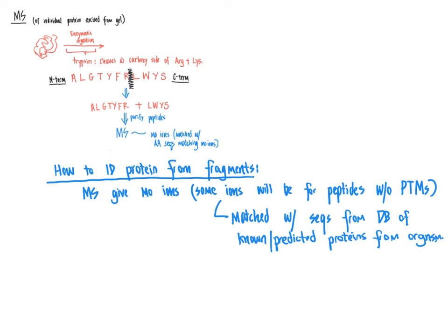And that will allow the identification of the particular protein of interest. And that identification can be further supported by going back and looking at the PI value that was determined by the 2D gel and the molecular weight, approximately, of the whole protein that was determined by the gel.